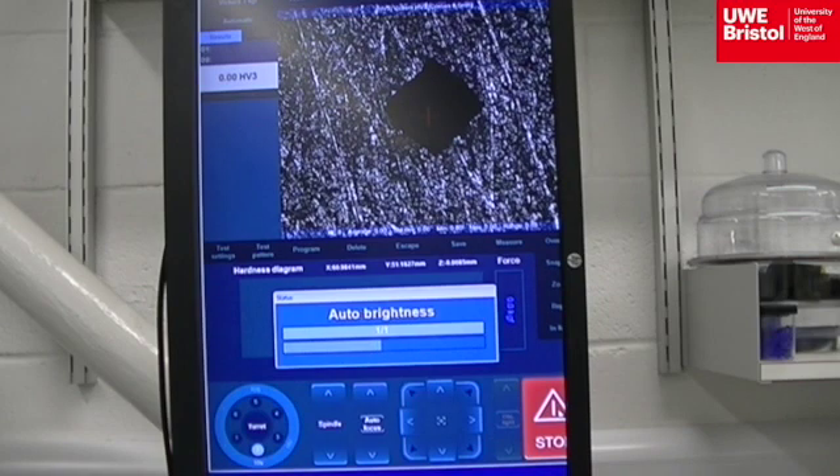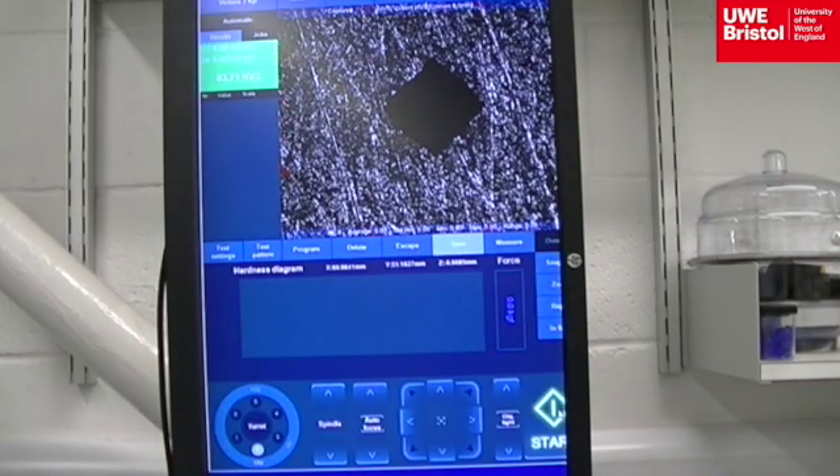The software autofocuses and attempts to locate the corners of the indentation, which is easier for it to do on a polished surface. However, often it requires human intervention to locate them.